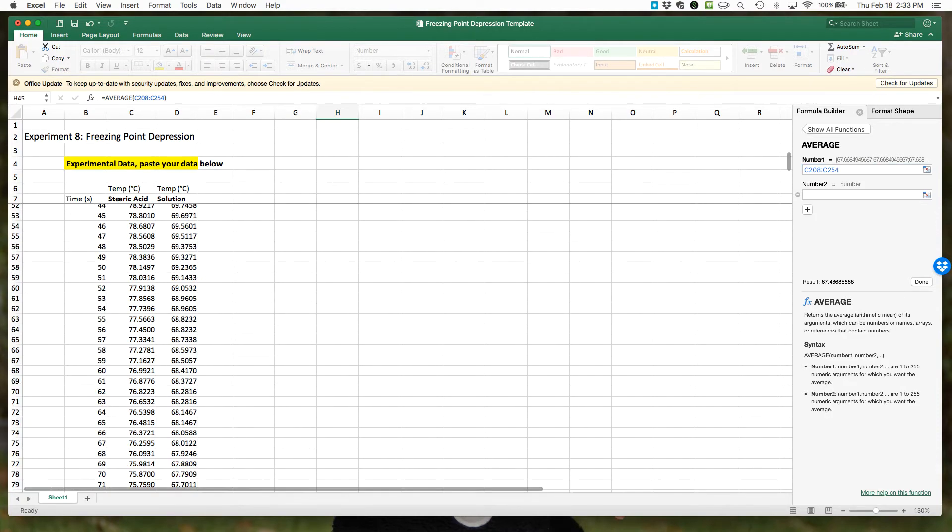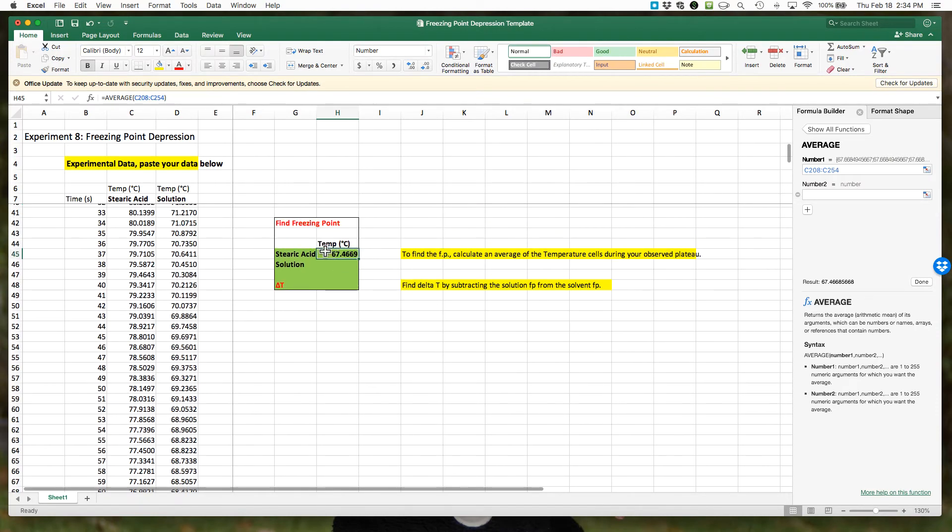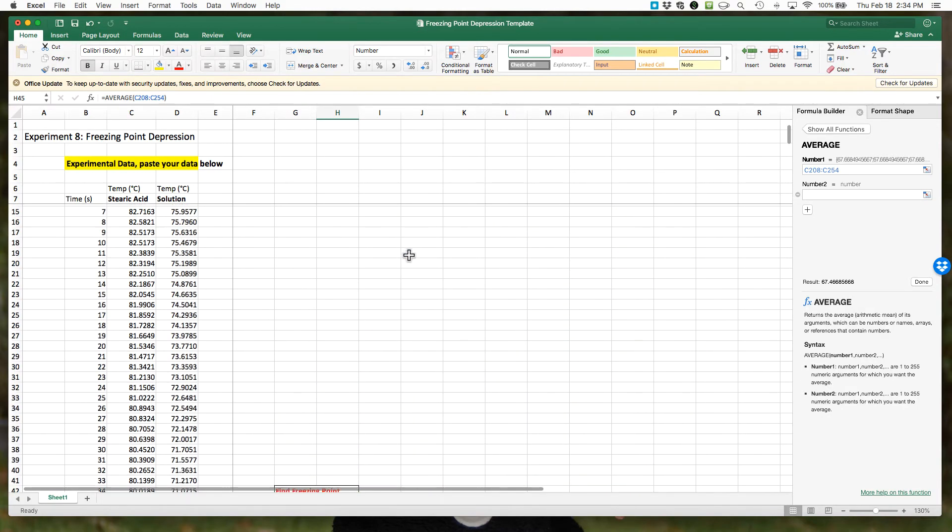Go ahead and hit return, and you can see this calculated an average of those values.